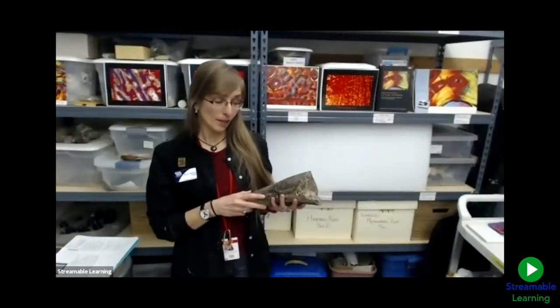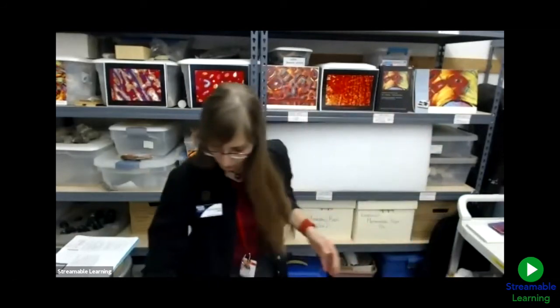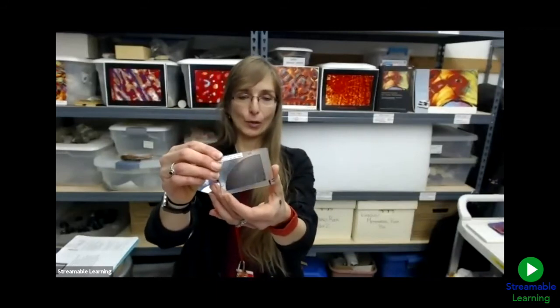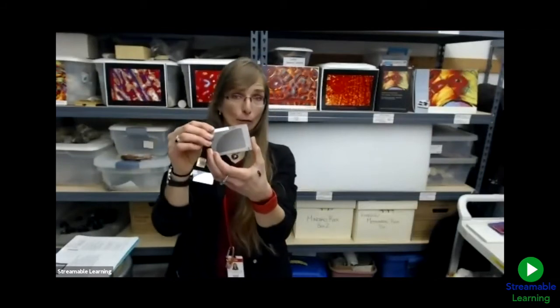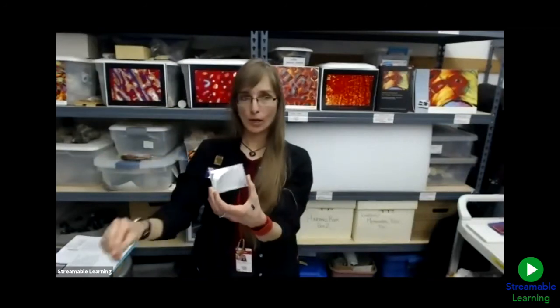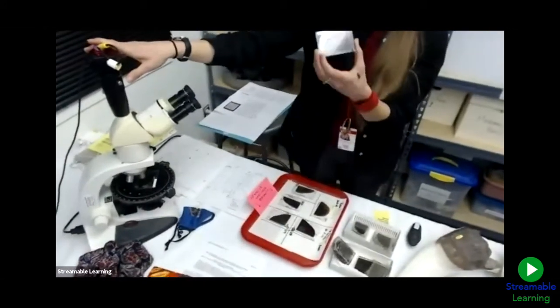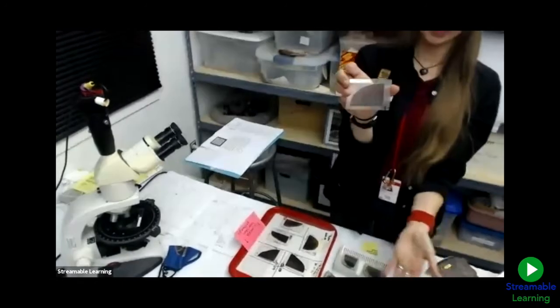A paleohistology project could begin with a question such as, how old is this Triceratops? We will begin the process with the intact full fossil, such as this Triceratops horn. And we will end the process with a thin section slide. So I'll bring that up so you can see that close. This is a thin slice of fossil material, about as thin as a human hair when we're finished with processing. This is thin enough for light to be passed through it. Our next step is to take this thin section slide under a polarizing light microscope and examine the internal structure. So Ellen, that's a real piece of dinosaur bone in your hand? Exactly. This is actually from this Triceratops horn. Awesome.